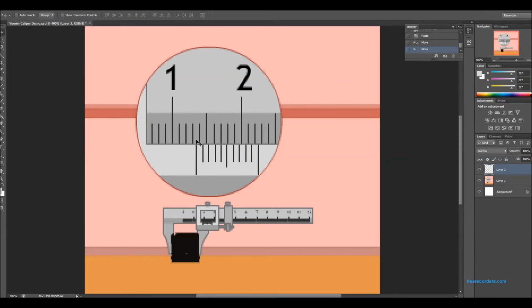Well, what's my next decimal place? What I look for in that is I look at these bottom lines in reference to the top lines. One of these sets, bottom and top, will line up almost perfectly. And I see that this one right here lines up, so it is a completely perfect straight line. That is your second decimal place. Well, what is that decimal place? That decimal place would be whatever this is on the bottom scale. So this line on the bottom scale is our second decimal.